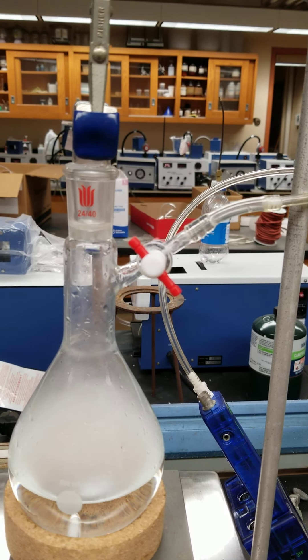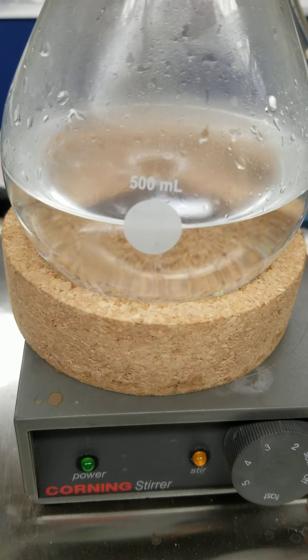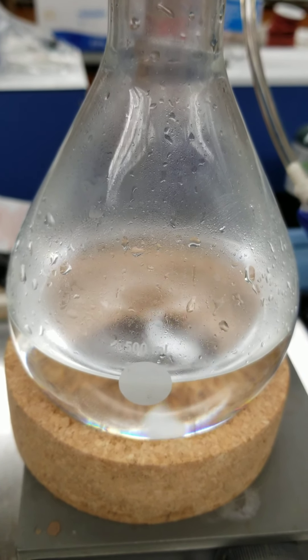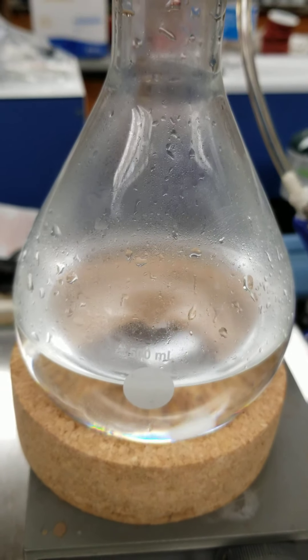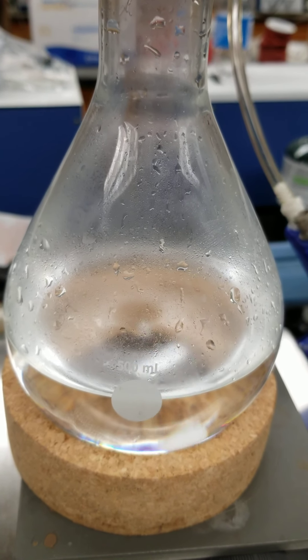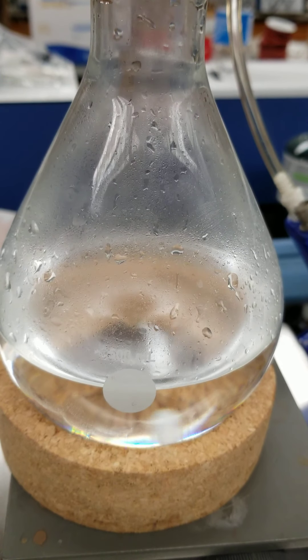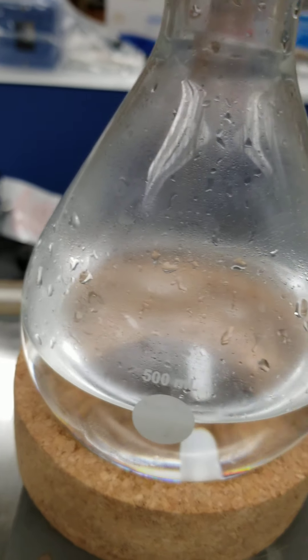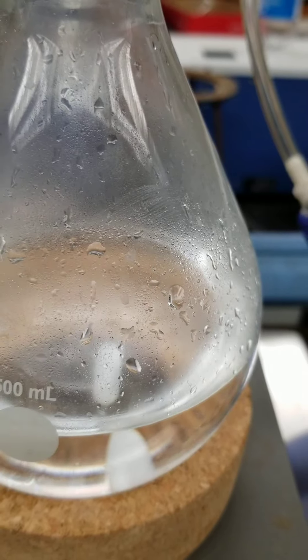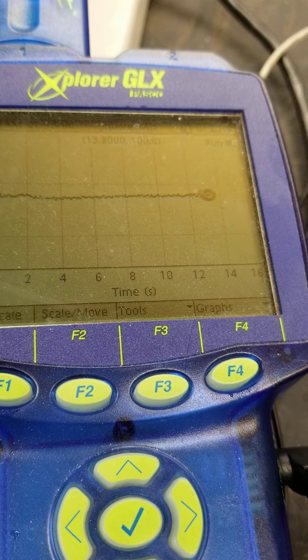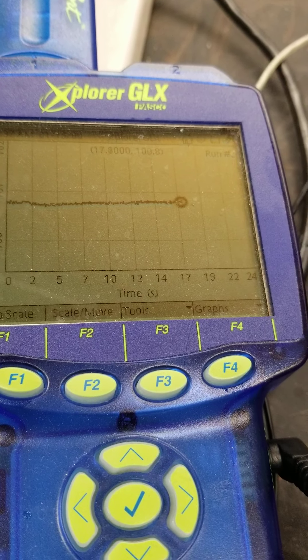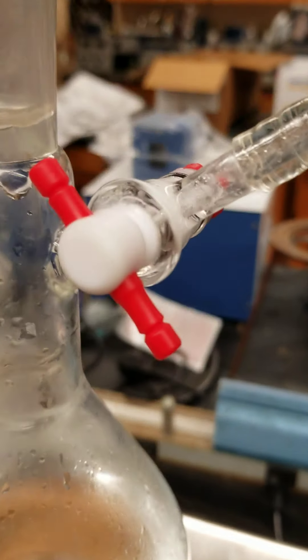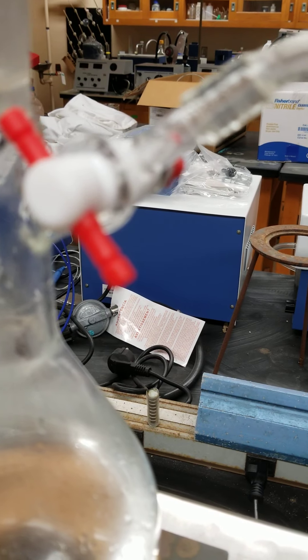Let's wait until it comes to equilibrium. I now visually see that all the dry ice carbon dioxide solid has sublimed and the solution looks clear. I'll stir this solution with the stir bar just a little bit and then turn it off. At this point I'll turn the data logger on. The data logger is just recording the base pressure. So now I'll open the valve so I can get the equilibrium pressure.